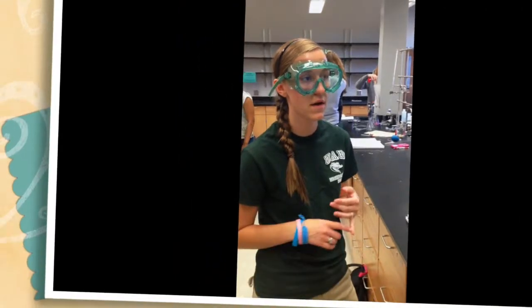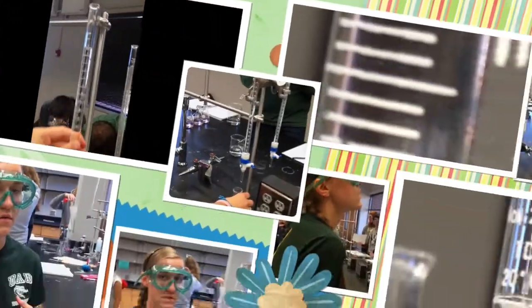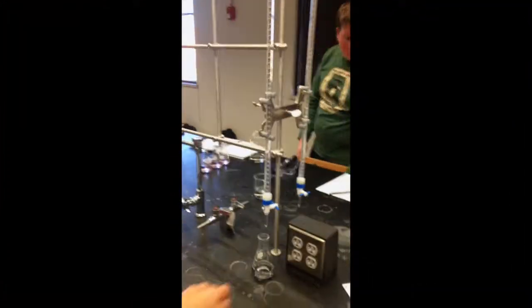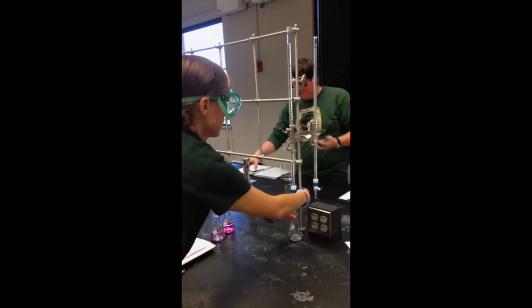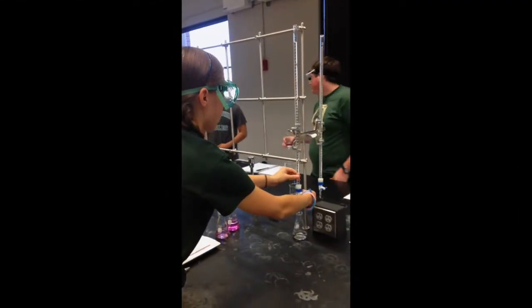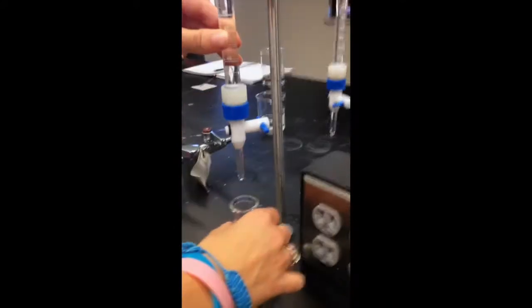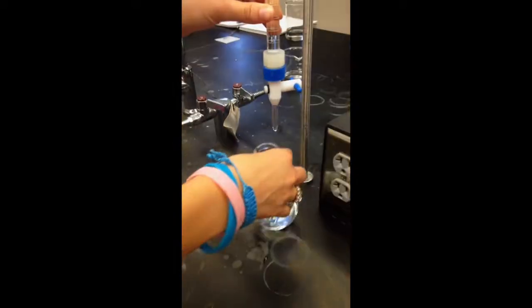So we're doing a titration, and you use your titrations to find out the concentration of an unknown substance, KHP. So you start off with 0 milliliters, and you can read that. And so now I'm going to titrate. So I let out a little bit, and there was no change, but you should still swirl it afterwards.